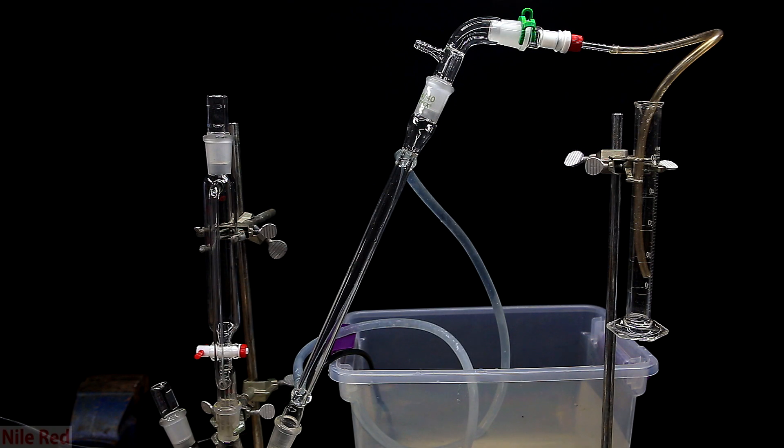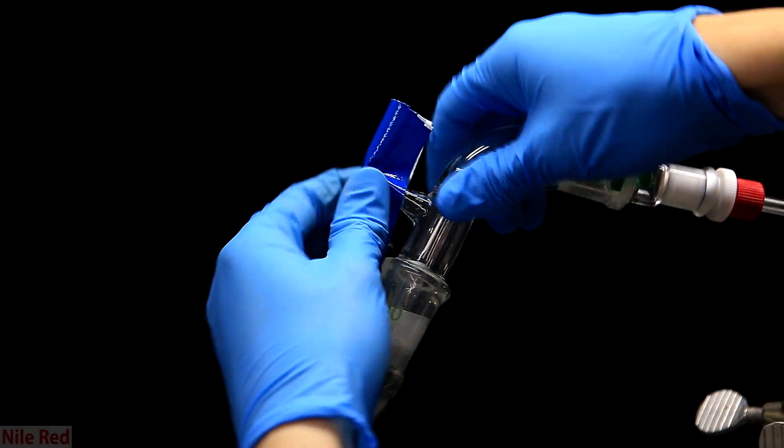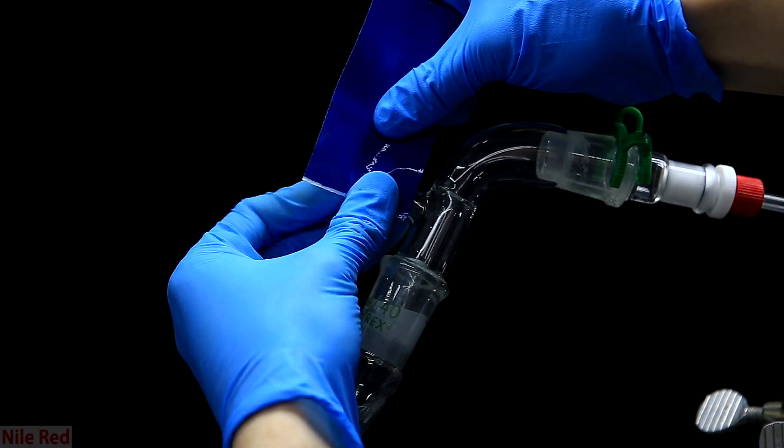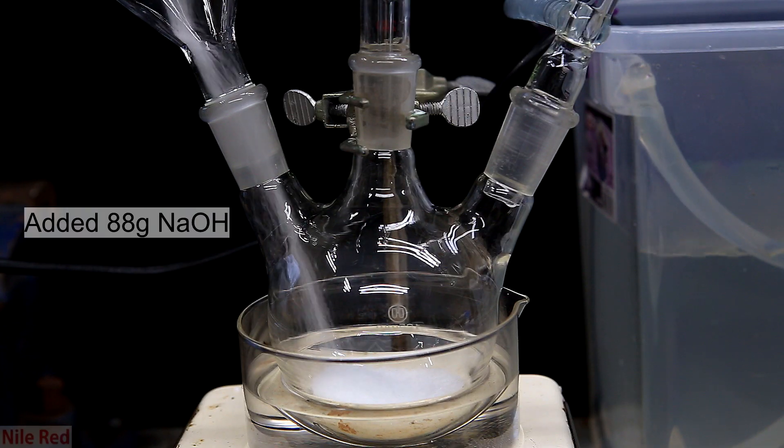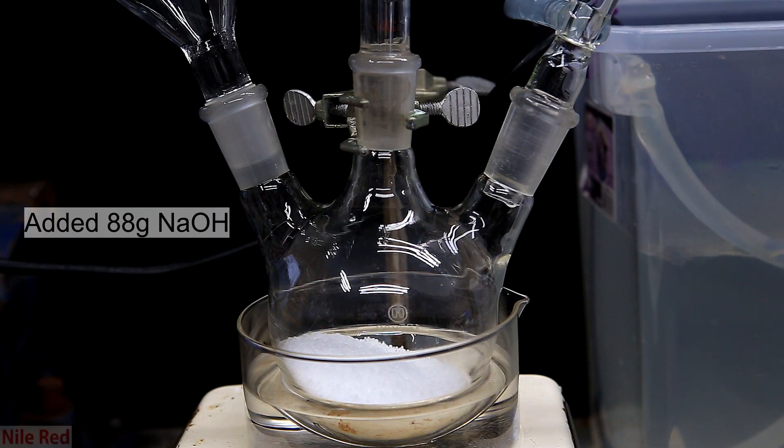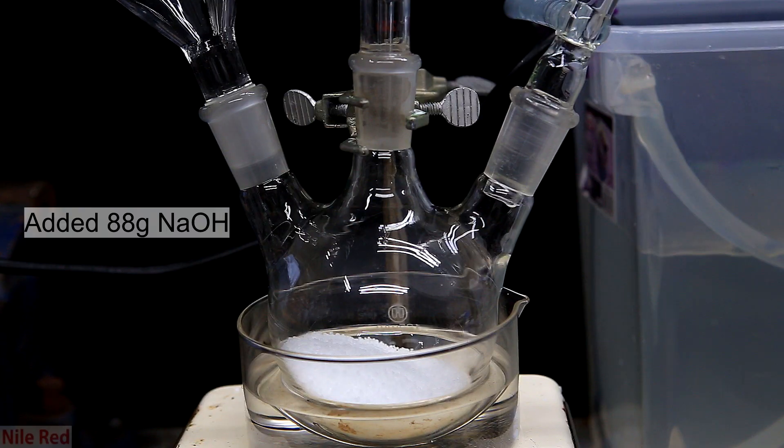It should also be noted that all of the joints are sealed with a little bit of grease to make sure that the ammonia doesn't leak out into the lab space. The vacuum adapter is open, and I use a very sophisticated technique using tape to block it. So to our reaction flask, I first add 88 grams of sodium hydroxide. This is in excess of about 10% to account for the about 10% water content in commercial sodium hydroxide.